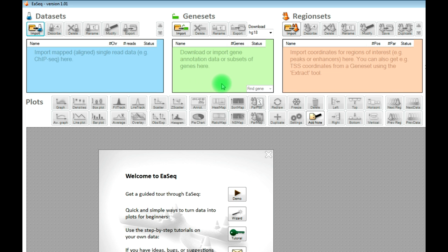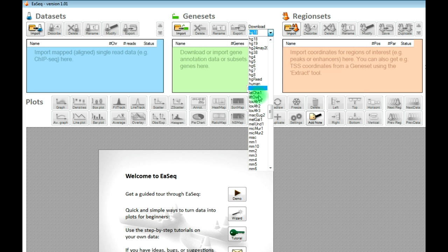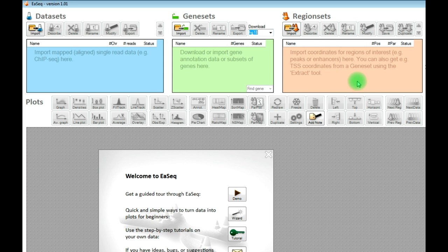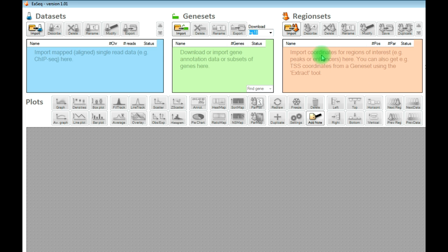Then we have gene sets, which are information about the positions of your genes and gene features in your reference genome. You can download them directly from UCSC using the download link — just select the gene set you would like to download. Finally, we have region sets, which are your points of interest, your regions of interest. Think of them as your viewpoints. For instance, if you want to visualize your ChIP-seq signal at CpG islands, then you need to have the coordinates of these CpG islands imported as a region set. There could also be enhancers or peaks generated with another program or from a published paper.